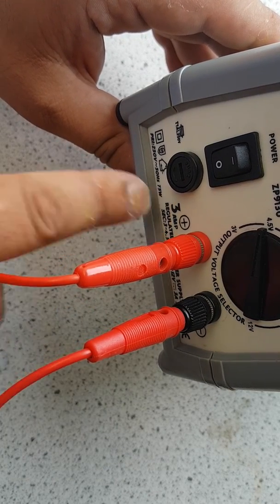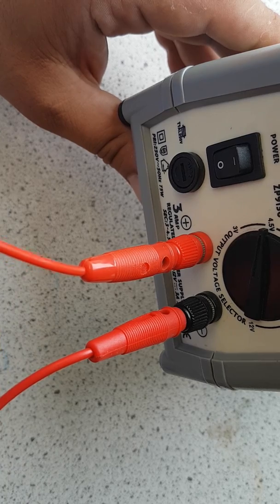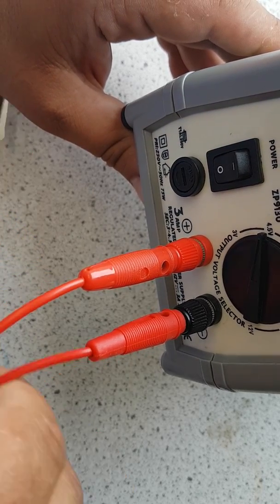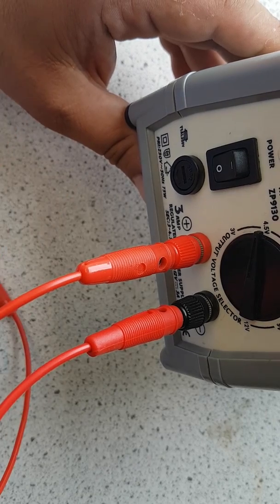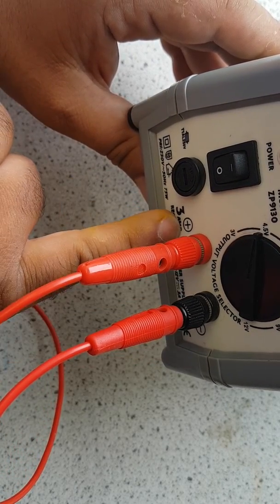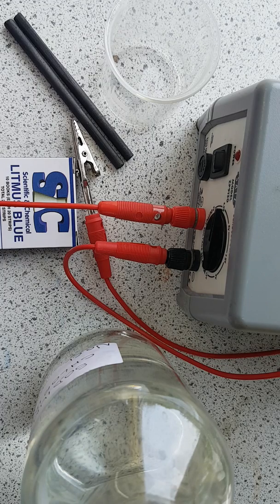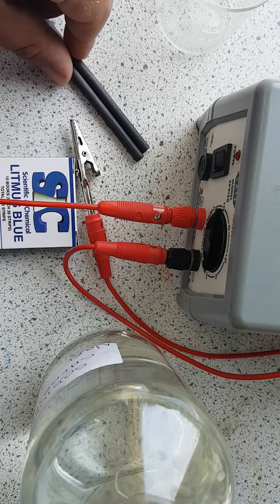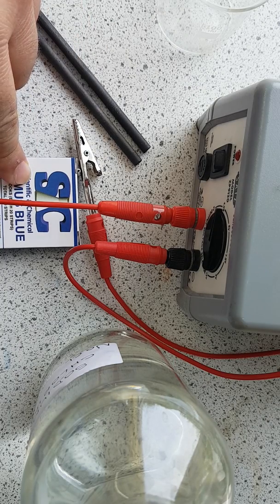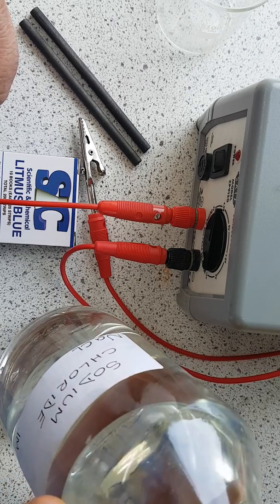On the power pack we've got a positive end and a negative end, and this is really important. This wire is always going to be carrying a positive charge relative to the other one. So the equipment we need: the power pack, a 100ml beaker, two carbon rods as our electrodes, blue litmus paper, two wires, and a solution of sodium chloride.